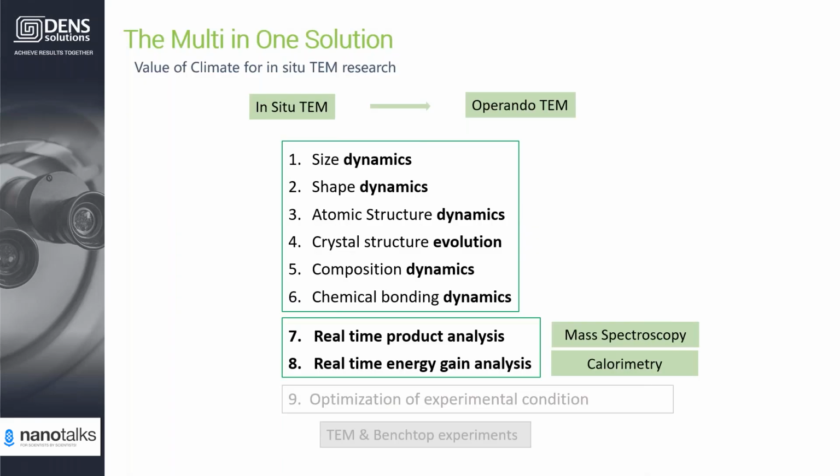So through these applications, I wish I could show you that you can do everything when you are doing the characterization in the in situ TEM, at the ultimate spatial resolution, temporal resolution, and energy resolution of the in situ TEM.